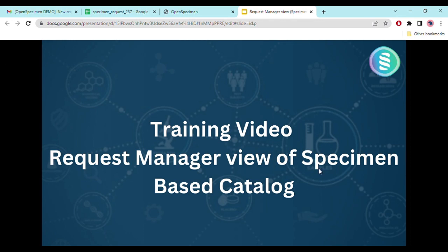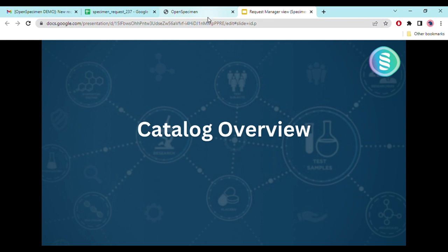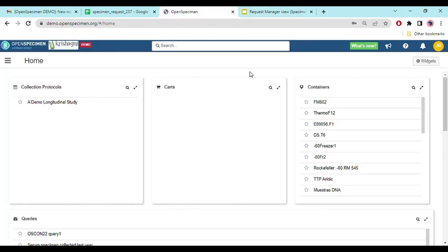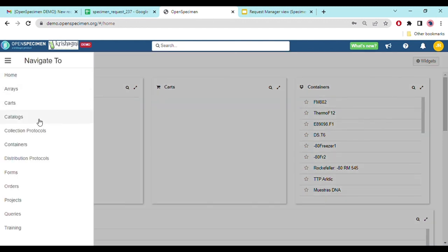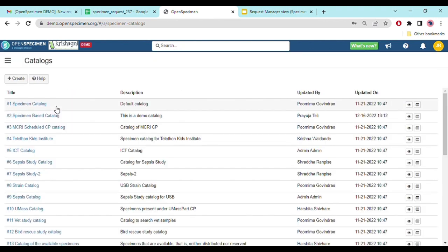In this video we'll see the request manager view of a specimen-based catalog overview. Once the request manager logs into OpenSpecimen, they can see different cards on the home page that they have access to. For a request manager to access the catalog, it's necessary they have access to the data shown in that catalog, and if specimens are stored in certain containers, access to those containers as well. Let's navigate to the catalogs, where you can see a list of catalogs the request manager has access to. I will be using a specimen-based catalog for demo purposes.